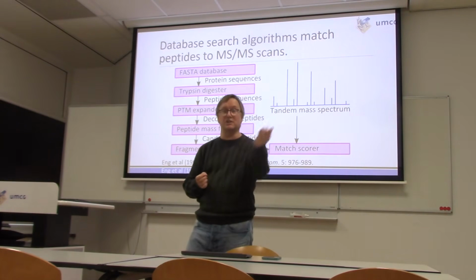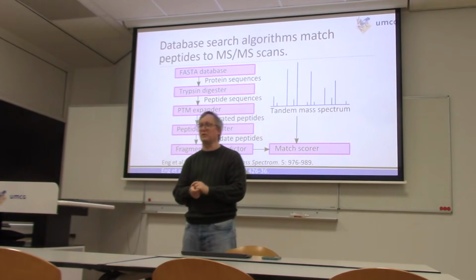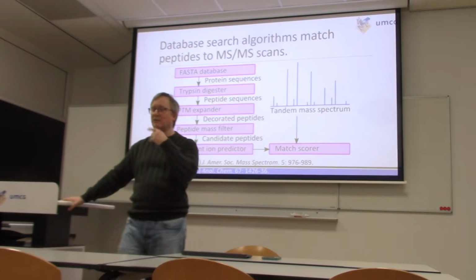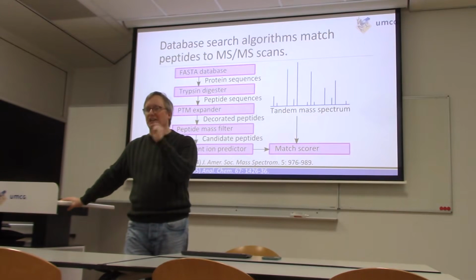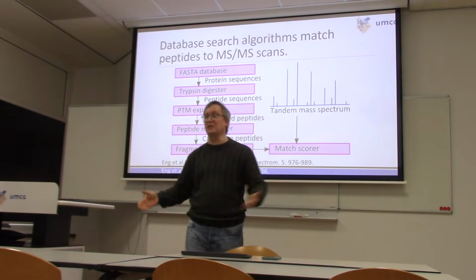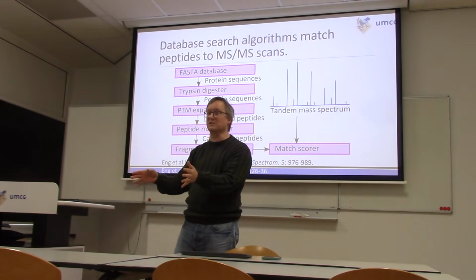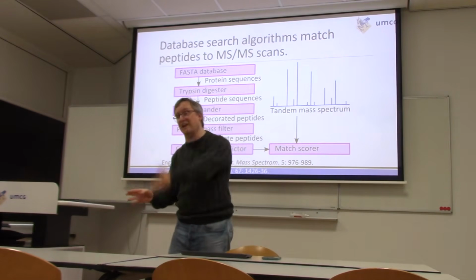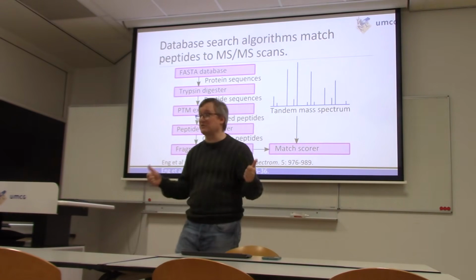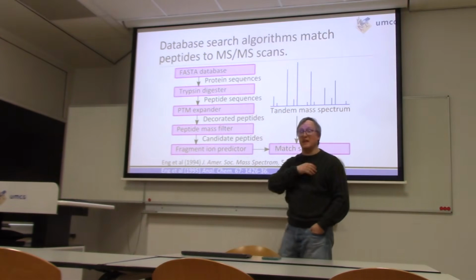Now, how many protein coding genes do we have for humans? Anyone? Yes? 20,000? About 20,000. That's a pretty safe answer, yeah. Somewhere in the neighborhood of 20,000. And yet, because there are multiple splice variants possible for those genes, we actually have a big expansion in how many sequences are possible. And if you include not just reviewed and unreviewed sequences for human proteins, but also include SwissProt isoforms on top of that, you're above 100,000 proteins that are possible in humans. So that starts as our search base.